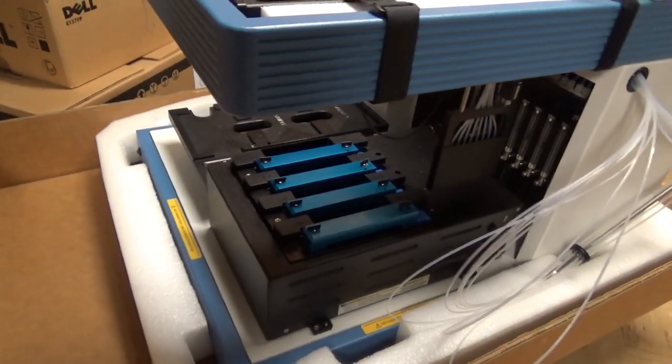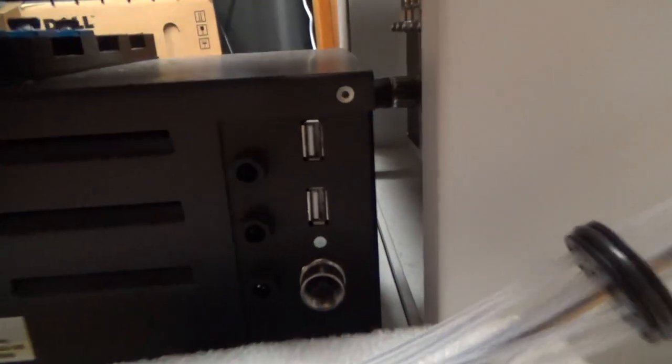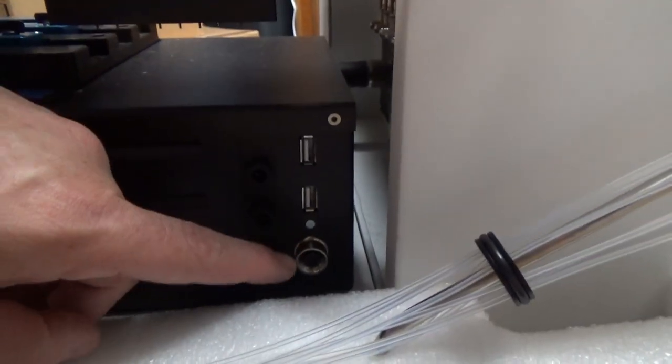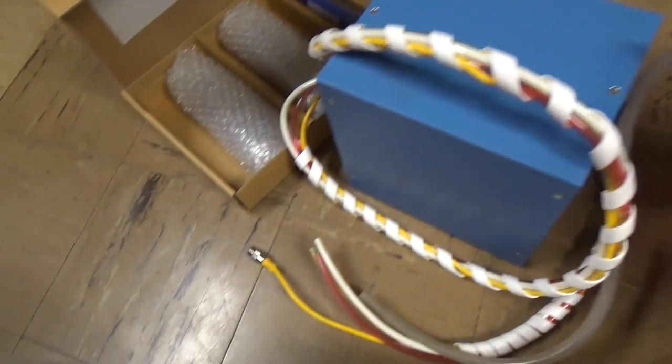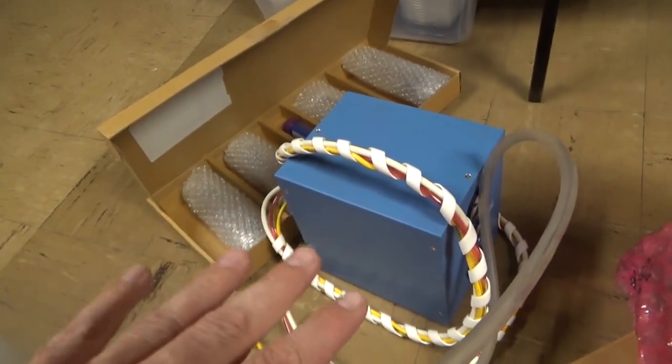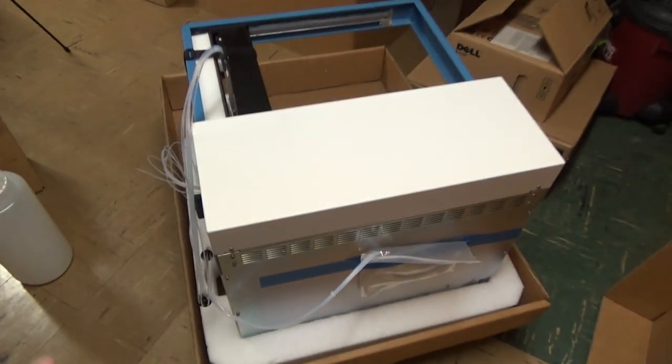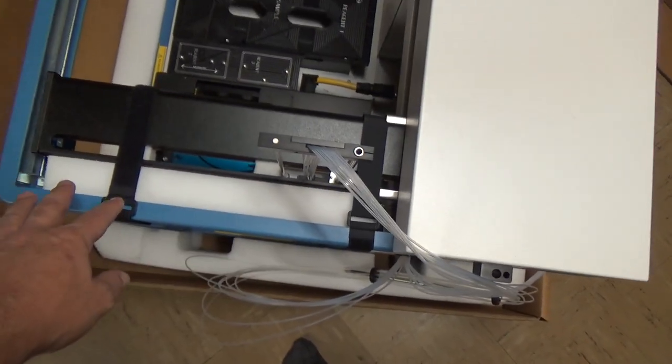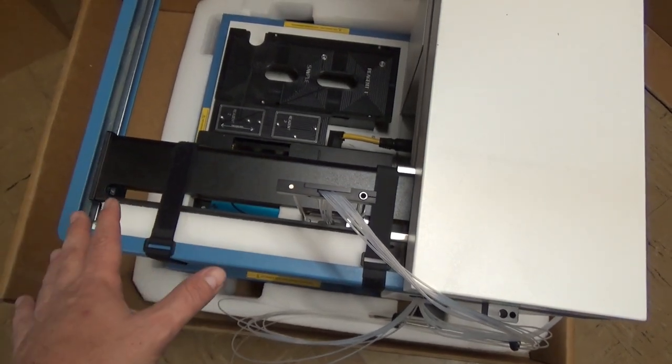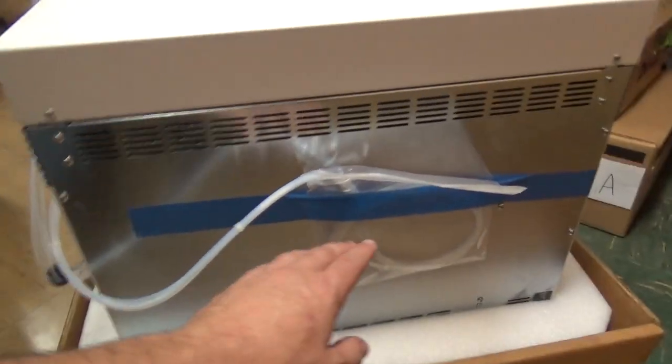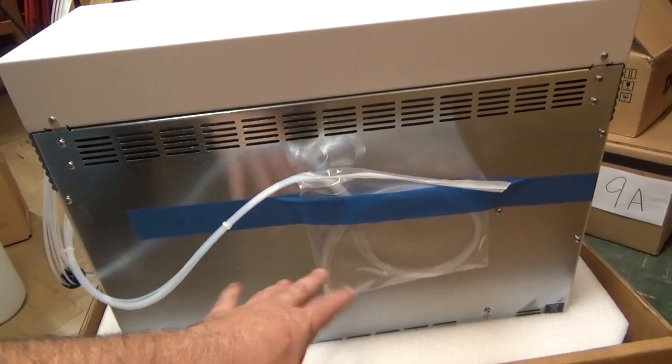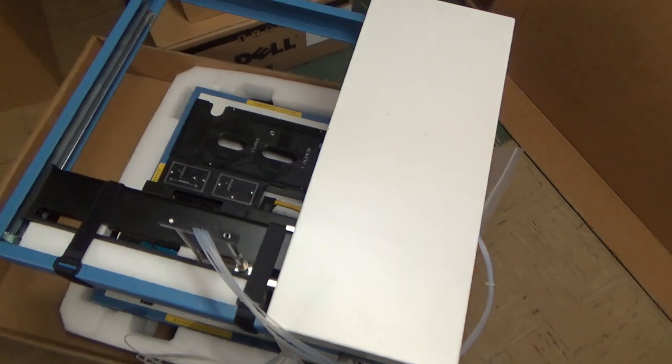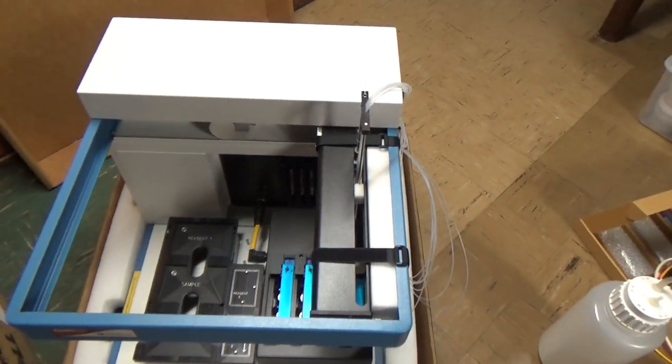But yeah, it's a little older obviously, and they don't really use this anymore. And like I said, I don't think the company is around anymore. So it might be hit or miss actually being able to do anything with this. There's some USB ports over there, so it does have some slightly modern technology. Now I think these ports here are going to match up to our other blue thing and some of the pressure ports that come in and out of that. I'm still not sure what this is or why it's a separate unit, but it definitely seems to interface over here. There's some signs that this is fairly new, especially because all of the packing material and kind of buffers and whatnot are in place. So it's definitely set up for shipment. However, there's also signs that it's used because there's some painter's tape on stuff and some of the things are just kind of loosely bagged up. So I don't know if this has been used.